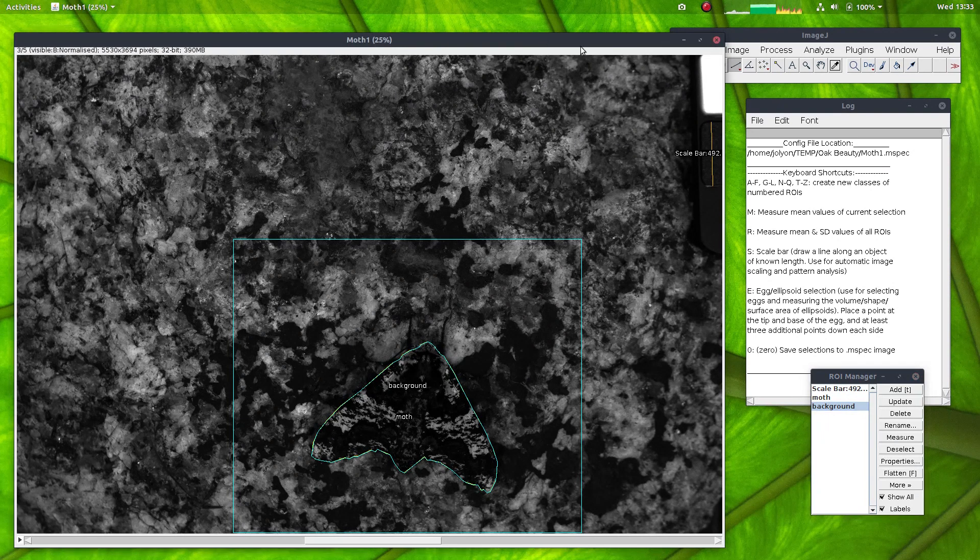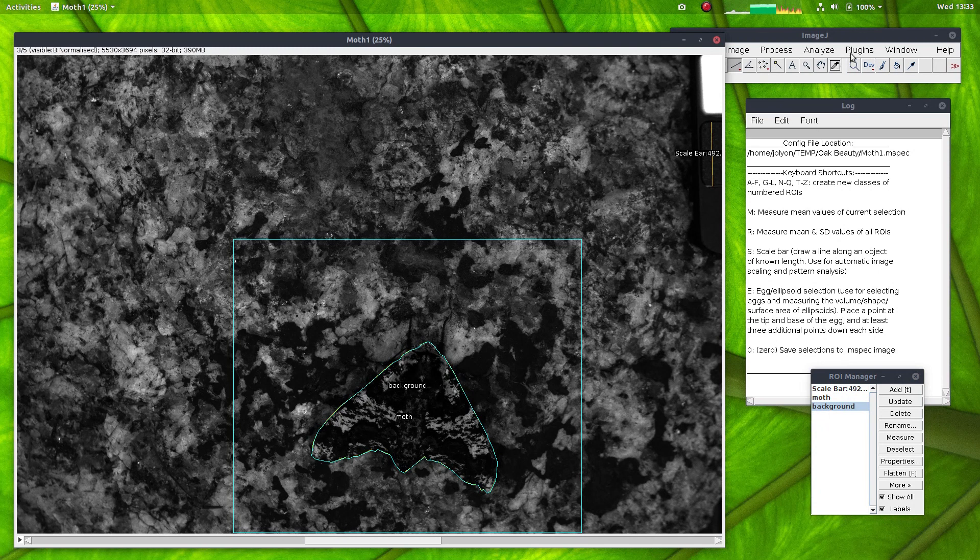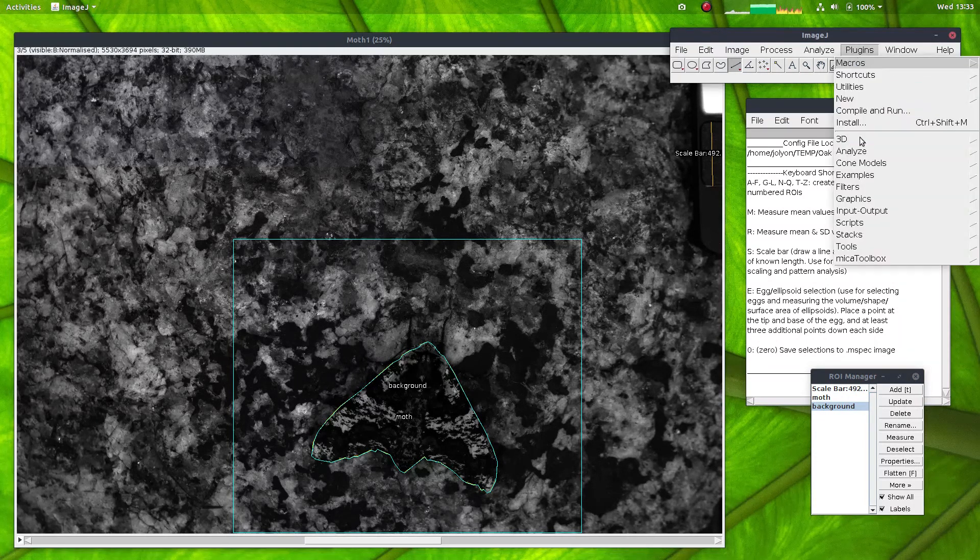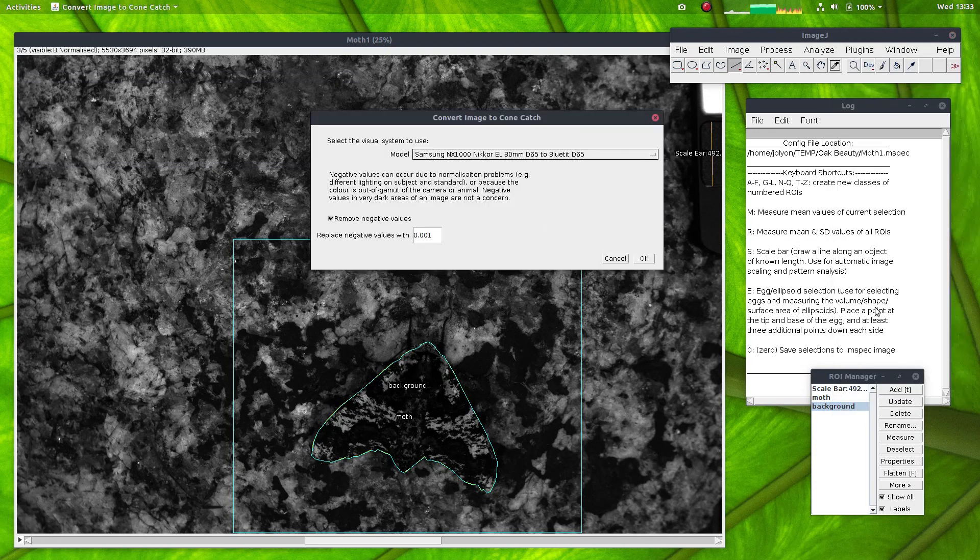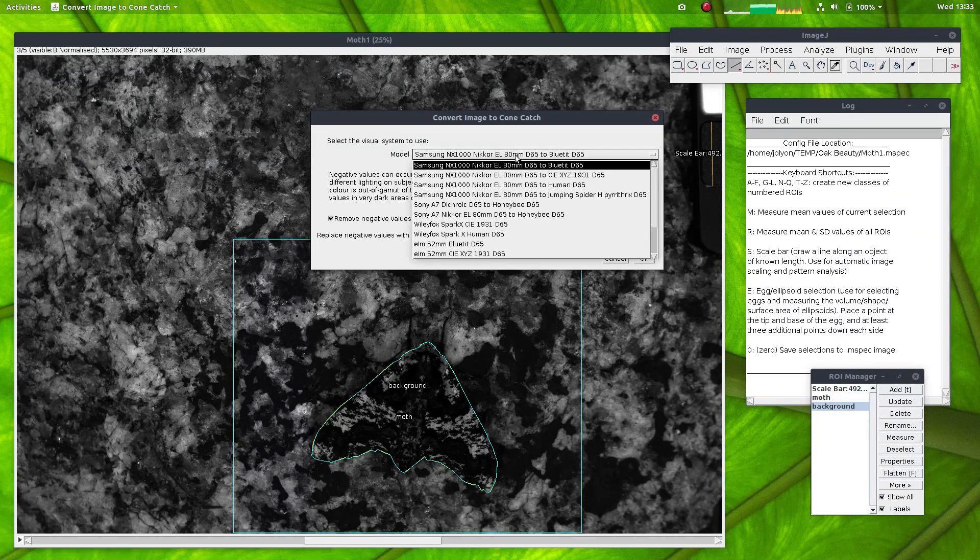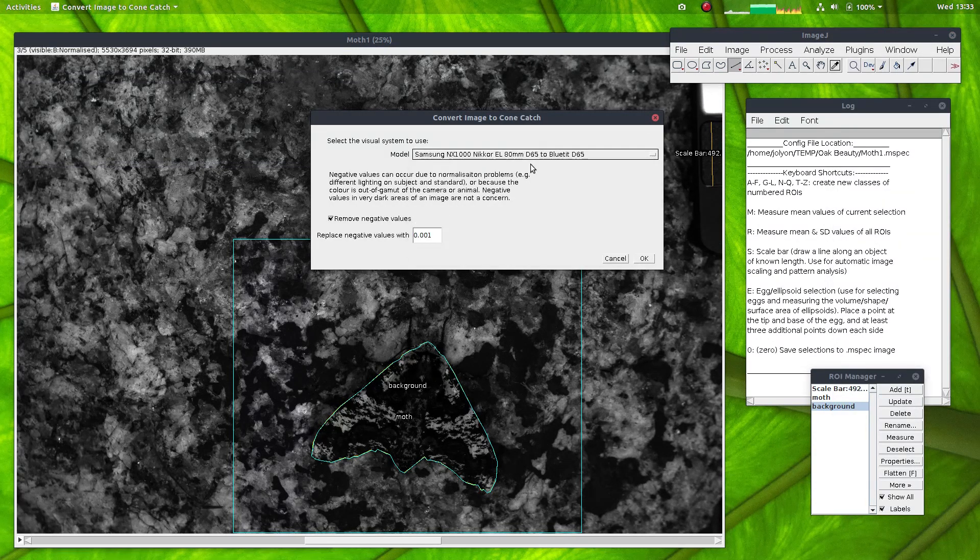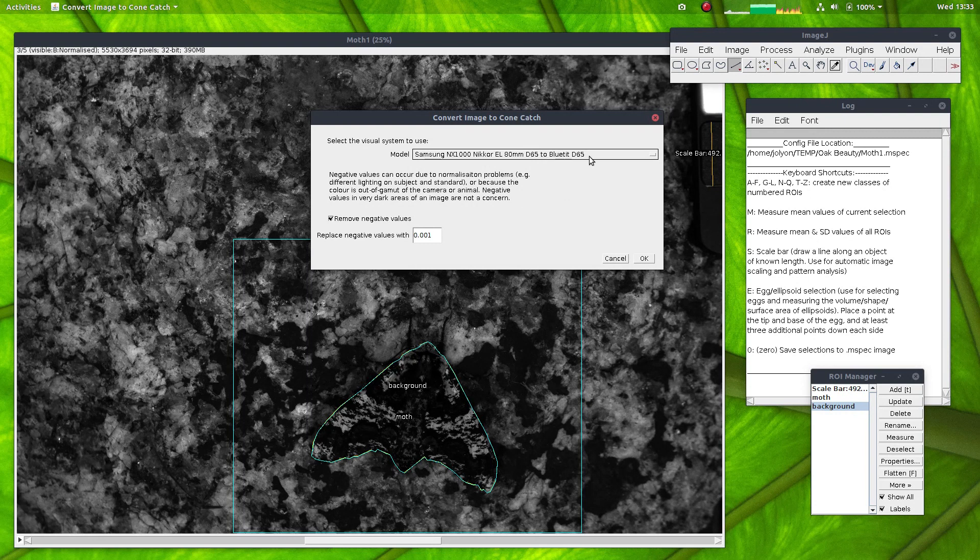Now we need to convert this image to cone-catch for the QCPA framework. So to do that, I'll go convert to cone-catch and select here the blue tit D65 lighting conditions and remove negative values.